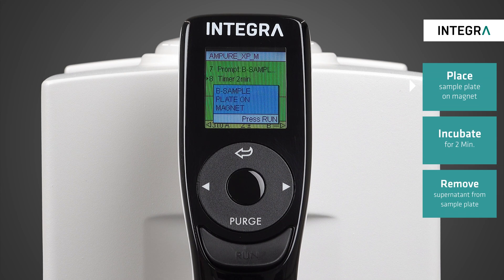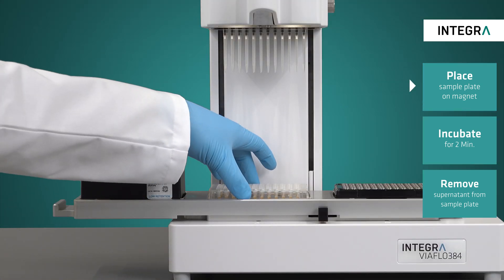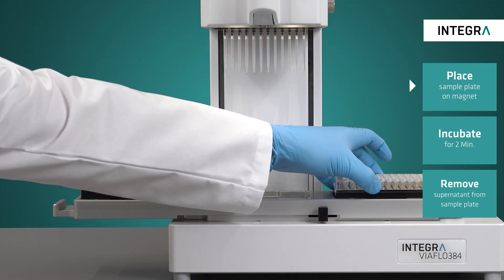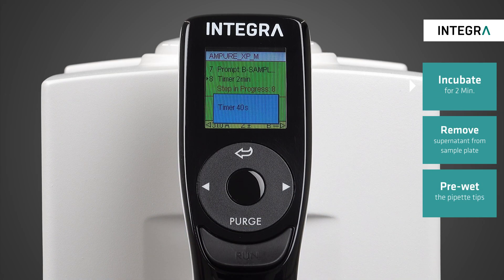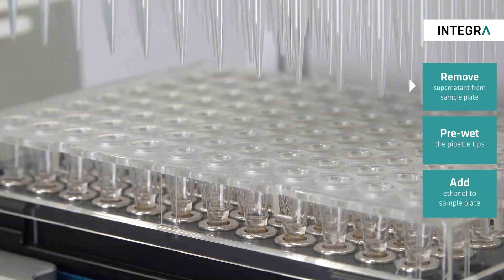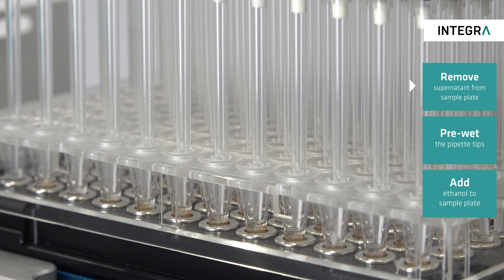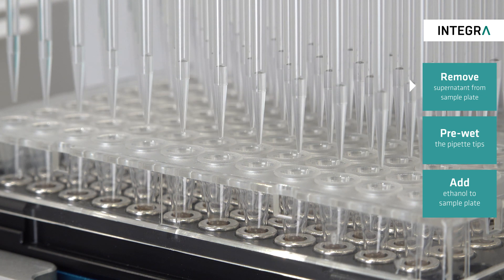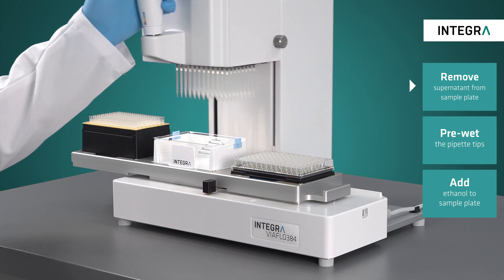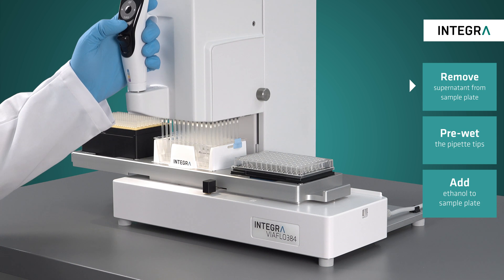Afterwards, the sample plate is transferred to the magnet on position B and given two minutes to allow the beads to separate from the solution. Now the supernatant is collected using a very slow speed. The height of the aspiration, like all others in the protocol, is already defined in order to prevent bead carryover and avoid wasting sample. After placing an automation-friendly reservoir on position AB, the supernatant can be dispensed into it for waste.